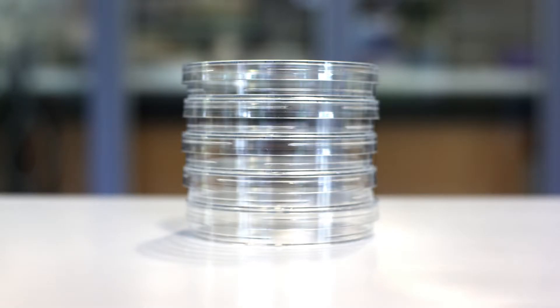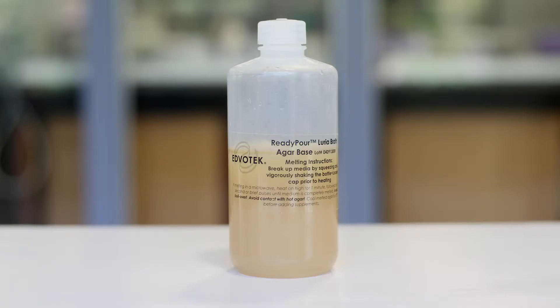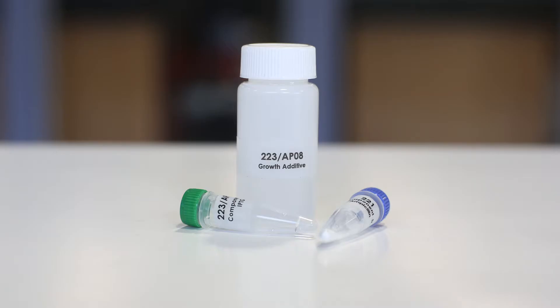Edvotec instructional videos: pouring agar plates. For this experiment you will need sterile petri plates, sterile pipettes, a pipette pump, Edvotec's ready-pour agar, and media supplements.